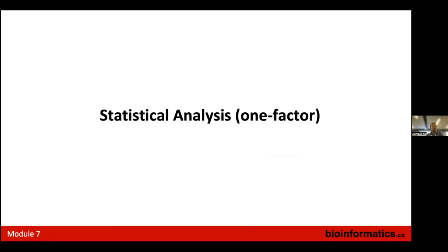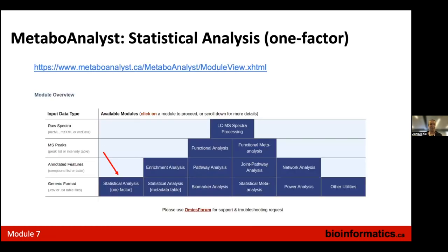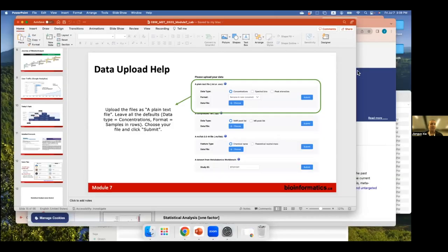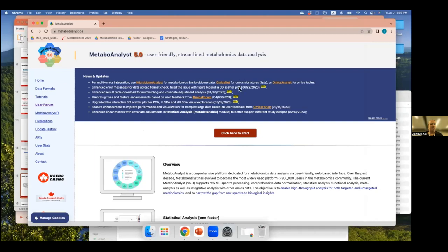Next, Jessica is going to give a demo on statistical analysis. We're going to do the statistical analysis one-factor module. We should be done this section by 3:45, and we want to try and analyze all three data sets from yesterday. I'll try to keep the demo brief and see how far we get. When you go to MetaboAnalyst, this is the module we'll be using: statistical analysis one factor.